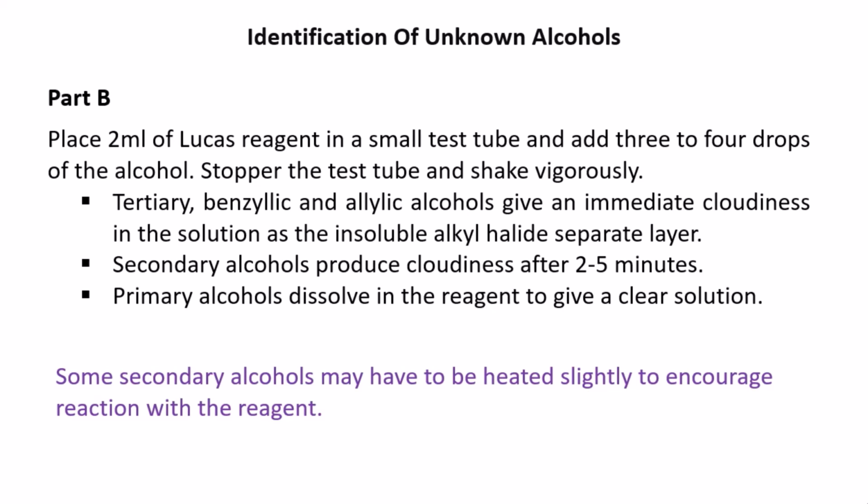Now, in the identification of an unknown, as I mentioned, the tertiary, benzylic, and allylic alcohols will give an immediate cloudiness. Immediately you add the Lucas reagent, the insoluble cloudy product is formed.